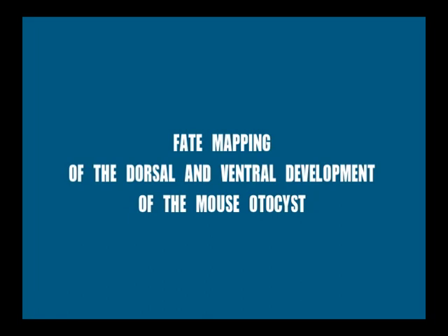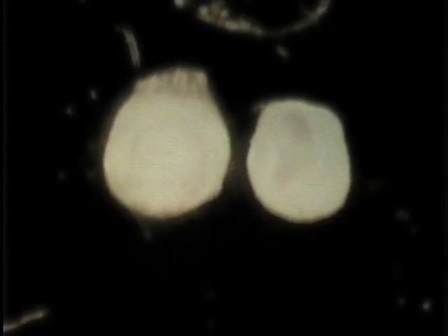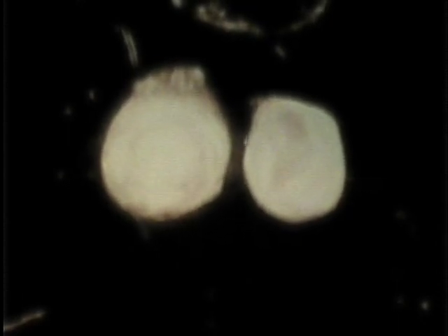The following time-lapse sequence shows the early commitment of cells of the undifferentiated otocyst to become specific portions of the inner ear. The otocyst has been cut in half. Each half was placed in the organ culture dish. On the left is the dorsal half of a 12-day otocyst, and on the right, the ventral half of a 12-day otocyst. Their growth is recorded for 5 days.